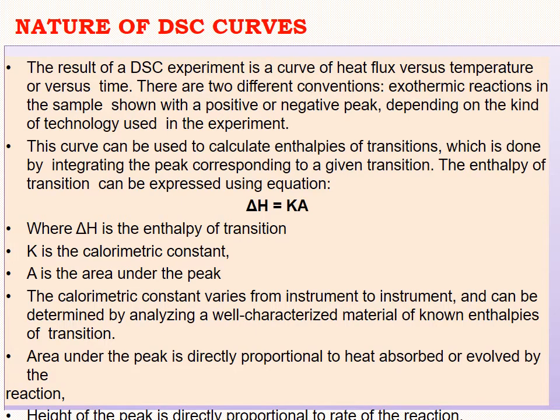Then we will talk about the curves, the overall heat flux as well as the temperature and time. We are going to plot a graph between the time as well as the temperature difference. So here there are possibilities of an exothermal reaction and an endothermal reaction. We know that endothermal is nothing but the absorption of heat from the surroundings, and the releasing of heat is called exothermal.